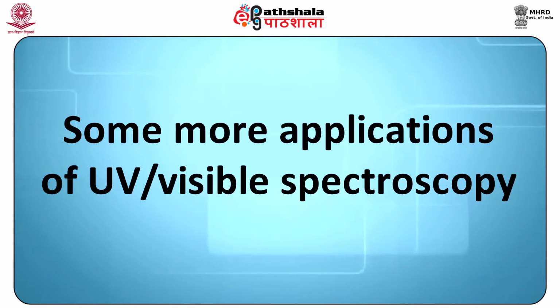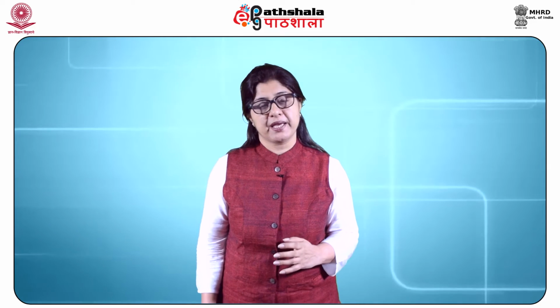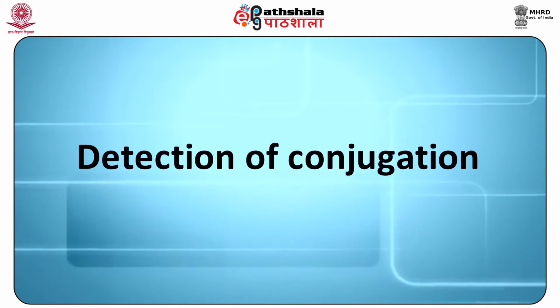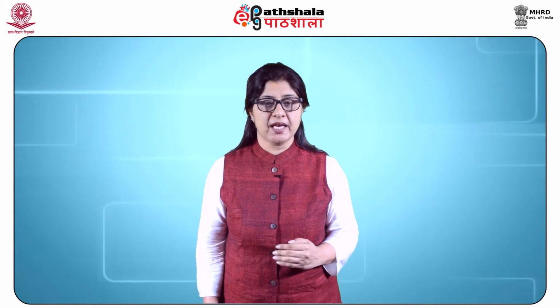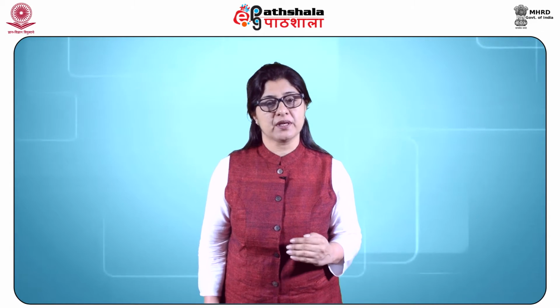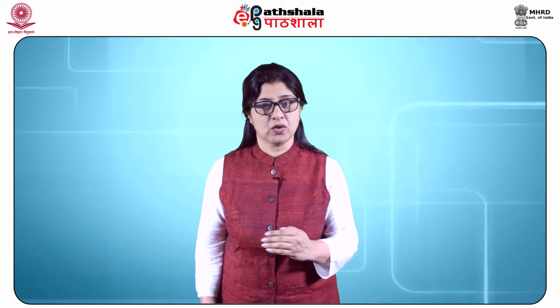Some more applications of UV visible spectroscopy are discussed. Detection of conjugation. With the help of ultraviolet spectrum, one can find whether a given compound contains a certain group in conjugation with each other or not.